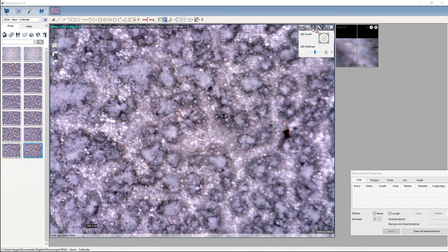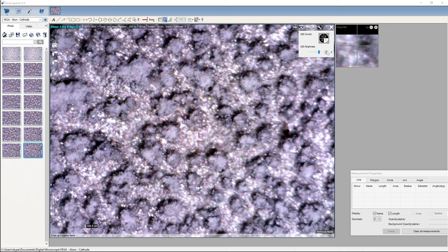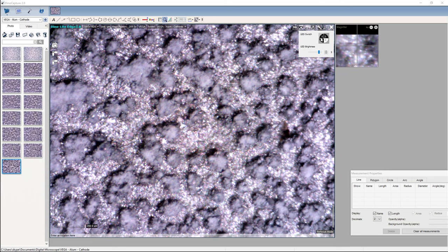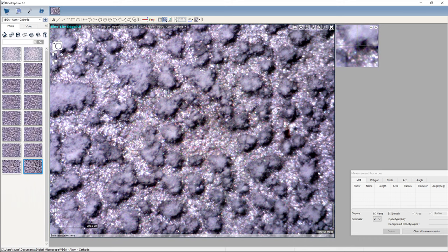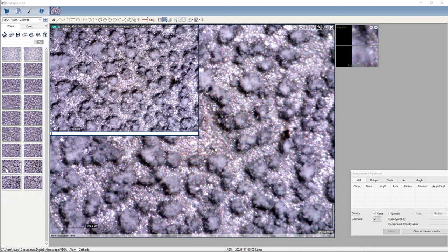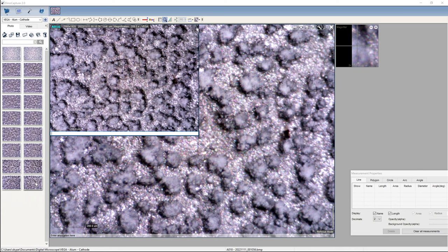Try a little different lighting here. Turn this off. This gives us some sort of different viewpoint. They're like little trees on a landscape, aren't they? Yes, so I think we can conclude that they are raised. Definitely raised. Okay.